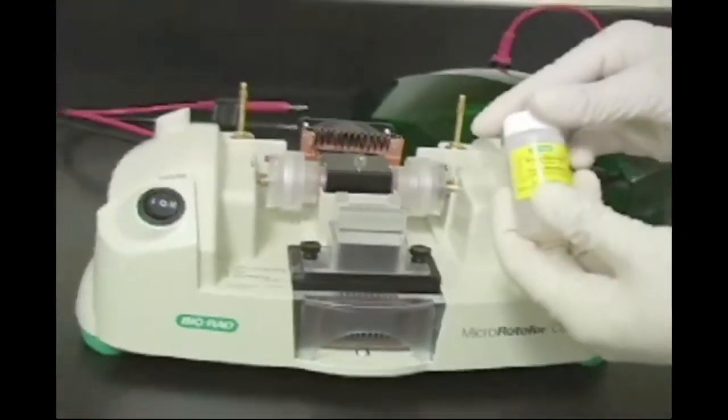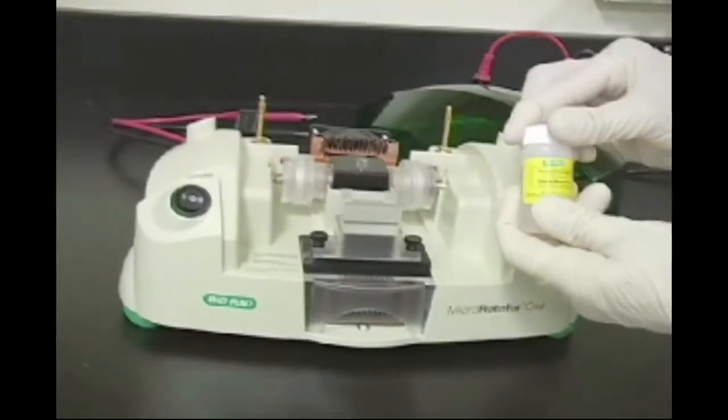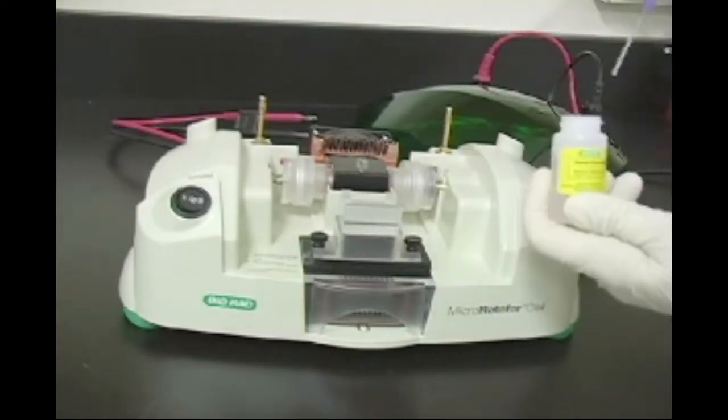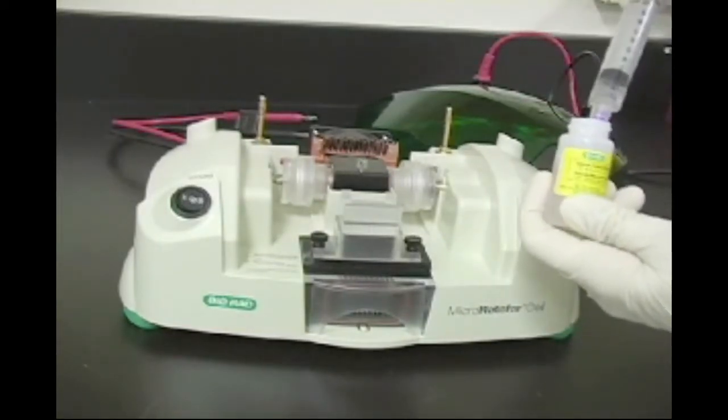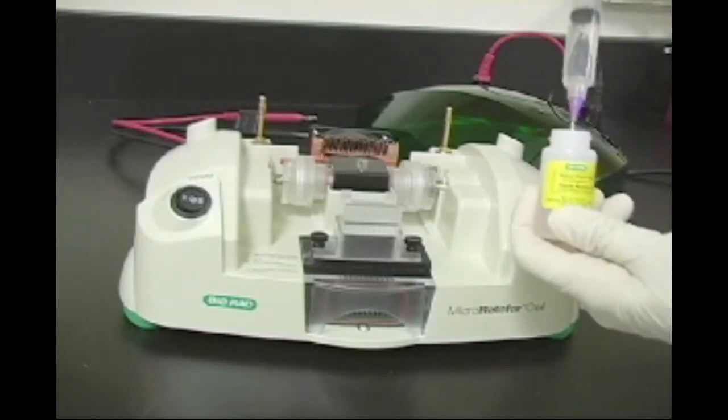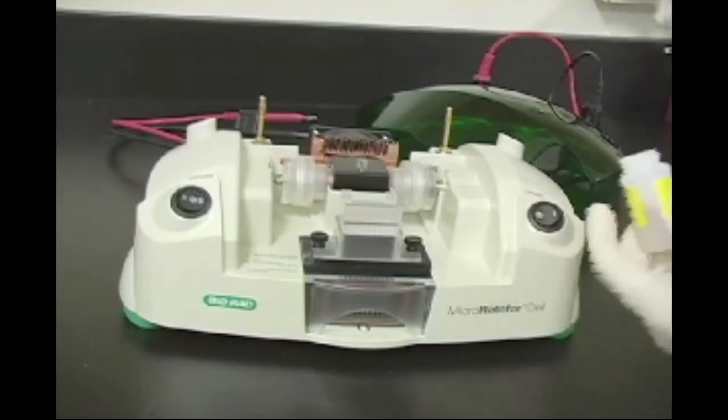Turn the power switch off. Using a 10 milliliter syringe, add 6 milliliters of 0.1 molar phosphoric acid through the vent hole of the anode or red assembly.